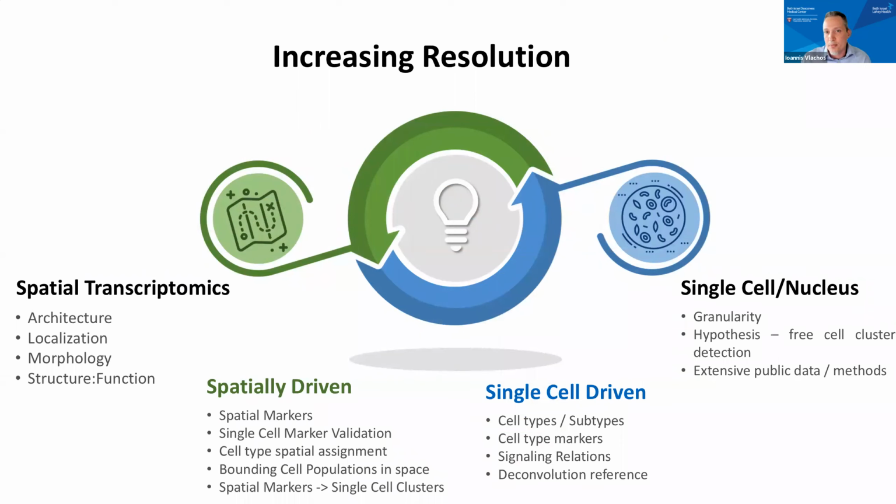And I would like to close by mentioning the most important take-home message, at least for me: the integration of these 2 technologies on the same patient samples is what's bringing this together. You can get your granularity and your maturity from the single cell, but you cannot go without the spatial component.